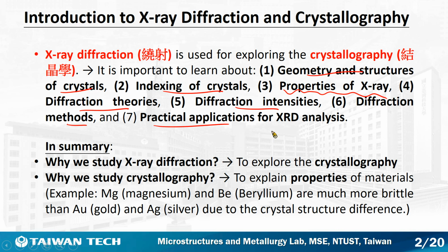So in summary, we just know the crystallography and the importance of crystal structure on the materials properties. So let's now learn how to use X-ray diffraction to explore crystallography.